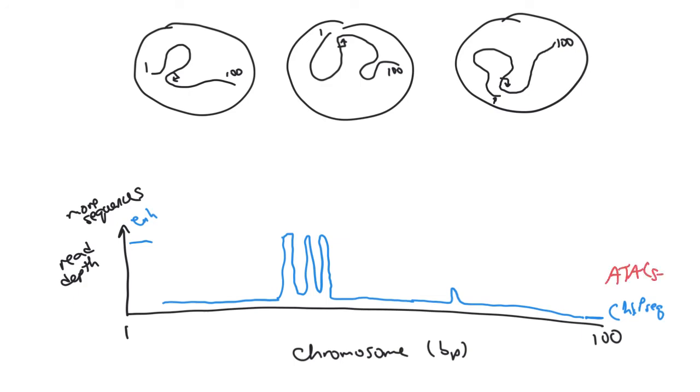ATAC-seq near the enhancer where there's euchromatin, and then it will drop off. We'll get a sort of a baseline background amount of sequence from other regions of the genome where transposons might rarely insert even in heterochromatin. And then we'd see a spike in the promoter transcript, and then we would see it drop off again.